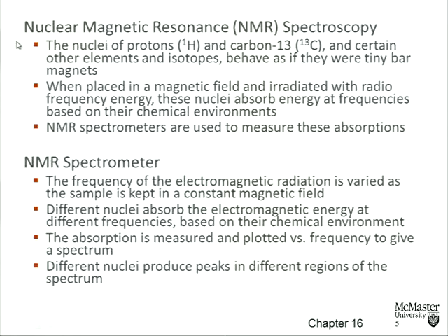So this is a nuclear phenomenon. In a magnetic field, so in an NMR spectrometer, we have a large magnet. We put a sample in the magnetic field, and we blast it with radio frequency energy. So this is very low energy, radio frequency measured in megahertz, almost the same frequency that you tune to in megahertz on an FM radio, right? So it's really like irradiating it with radio waves and making the molecules or the nuclei excited.